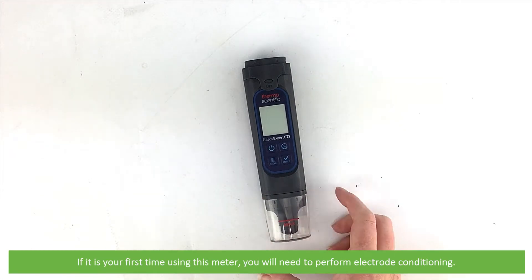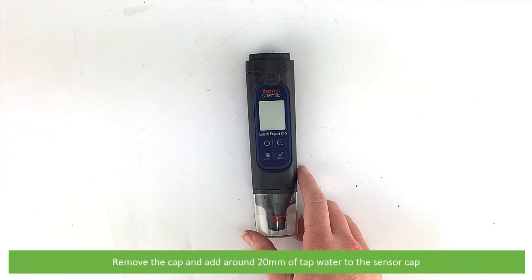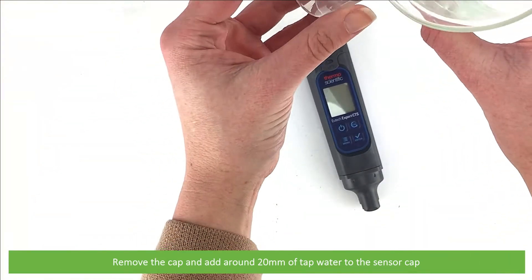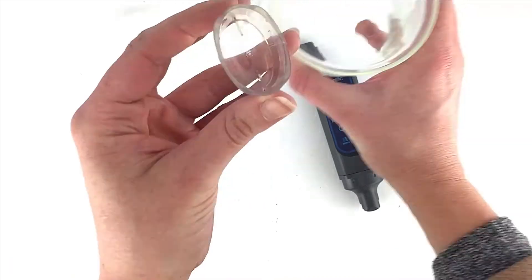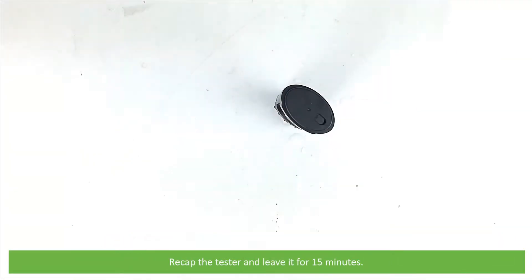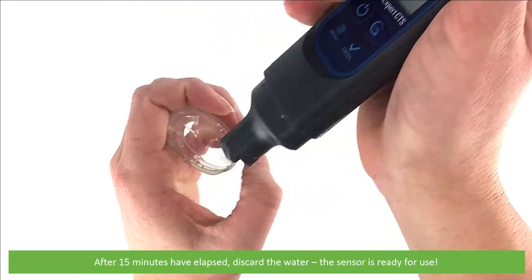If it is your first time using this meter you'll need to perform electrode conditioning. To do this, remove the cap and add around 20 millimetres of tap water to the sensor cap. Recap the tester and leave it for 15 minutes. After 15 minutes has elapsed, discard the water and the sensor is ready for use.